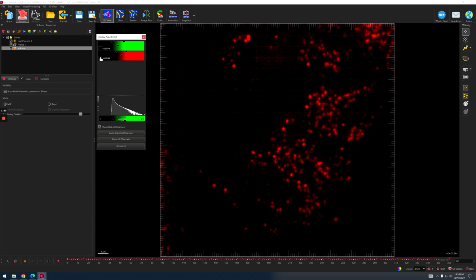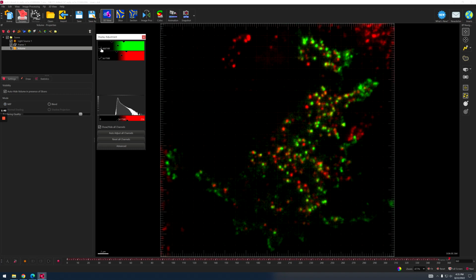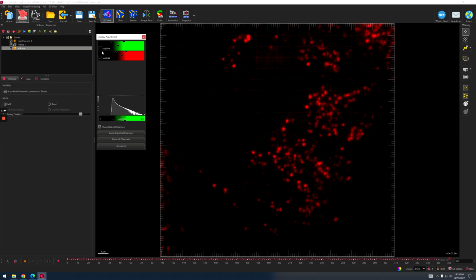And in the -1E green channel, there's normally more background in the cell. That's how I tell the difference. Sometimes you can also tell by the patterns of the content, which are a little bit different. So now I confirmed this is fine.